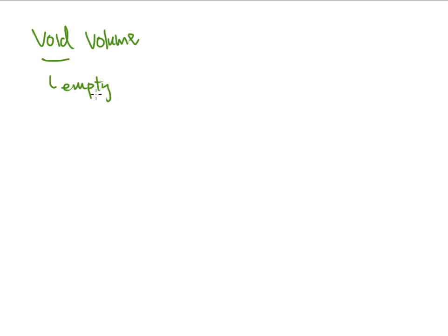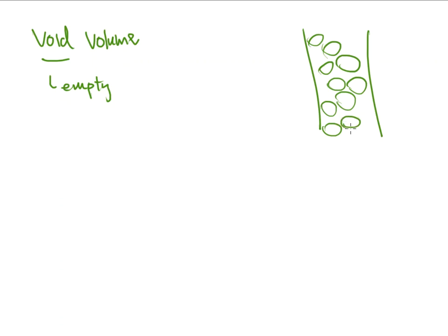It's an empty space. Okay, so here I've got this column, and on the inside I have these particles that can be different sizes. And now I know those particles can be made up of different functional groups on the surface of them. And now I know that in IC world, these surface areas of the particles can be positive or they can be negative. But look how I've drawn them here. It's the same way that I've always drawn them. I don't really squish them all together, right?